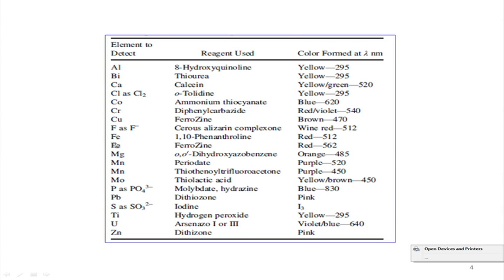These are all in either the ferric state or the ferrous state. When this solution is red colored, we should also label it with the lambda max: the solution is red, but it is absorbing in the green and yellow-green range, which is 512 to 562 nanometer, and which will be useful like your thiocyanate for the determination of iron in the solution.